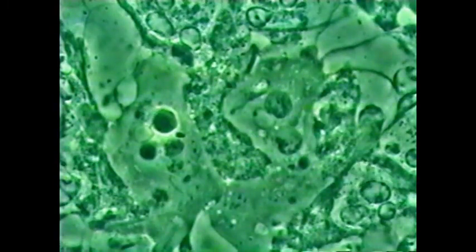Here again, two amoeba, Entamoeba gingivalis. On the lower and top right are many ghost cells. Those are remnants of neutrophils that have lost their nucleus to the parasites. Here again, one amoeba, two amoeba, three. So many of them are very present during the periodontal active disease.